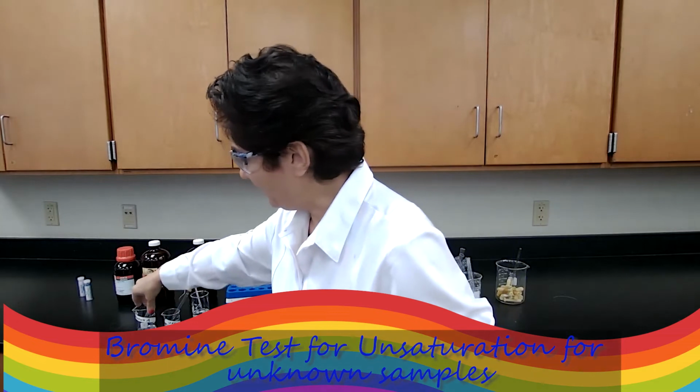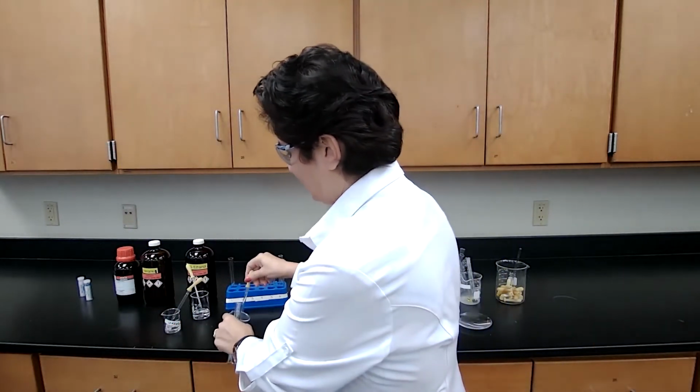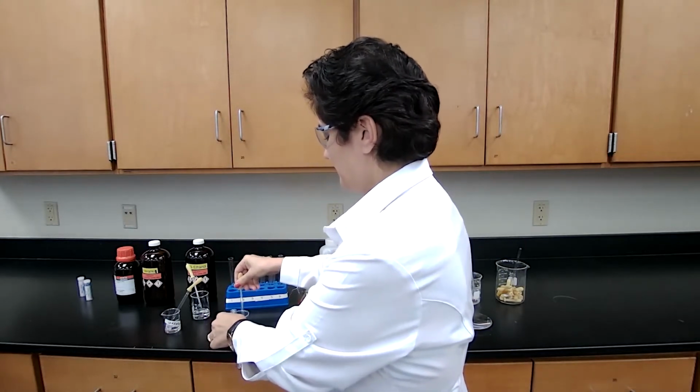I have two unknowns that I'm going to do the bromine test for unsaturation. For unknown A, I placed the sample in the test tube. So this is the unknown A.